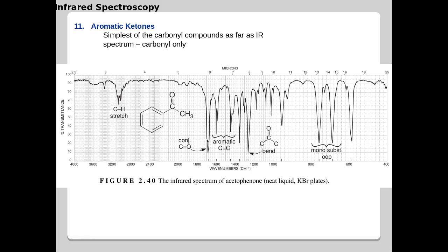And then what you'll be expecting are the asymmetric stretching vibrational frequencies or bands of aromatic C double bond C bonds here, then the CH stretching vibrations of the sp3 hybridized methyl carbon-hydrogen bonds here, then above that you shall be seeing sp2 CH stretching vibrations somewhat here of the phenyl carbon-hydrogen bonds.